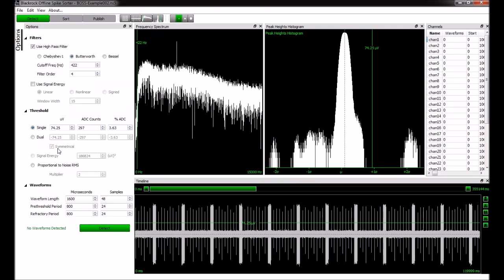So now that everything is kind of set up and ready to go, we could click the detect button at this point. But before we do so, I kind of want to give you an idea of what's going to happen when we do. So BOSS makes excellent use of multi-processor technology. This enables BOSS to spin off processing tasks into other threads so that it can continue chipping away at a file or a process while you continue working.